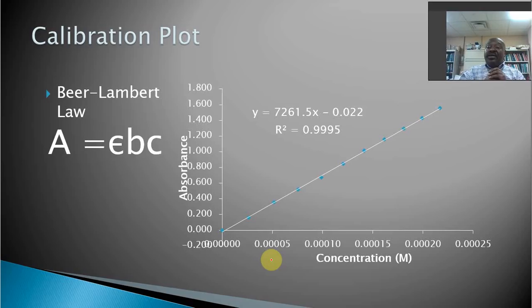Most people don't do this. They make different solutions. Formulas: 0.2 molar iron 3 plus, add 0.1 milliliters of 0.002 molar potassium thiocyanate in a cuvette. So don't remove the cuvette from the absorbance measuring system. Then put it over the stirrer, let it go, and then measure the absorbance.